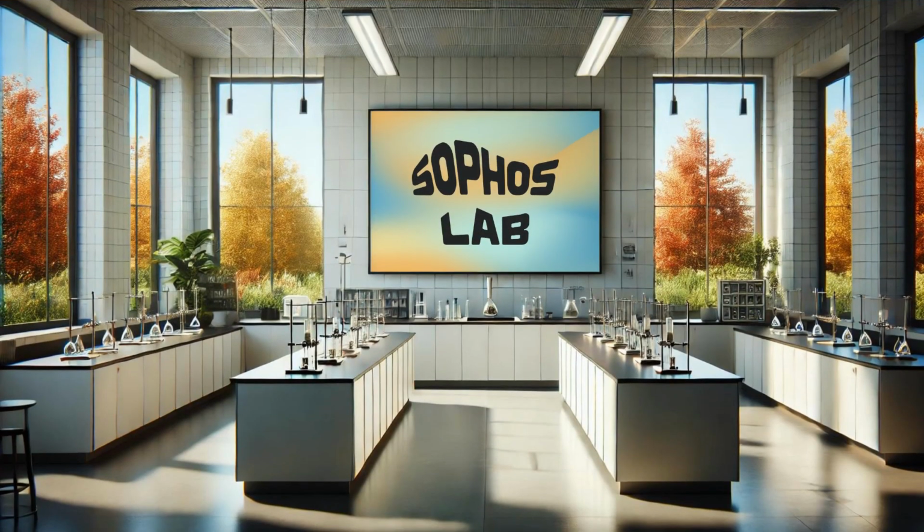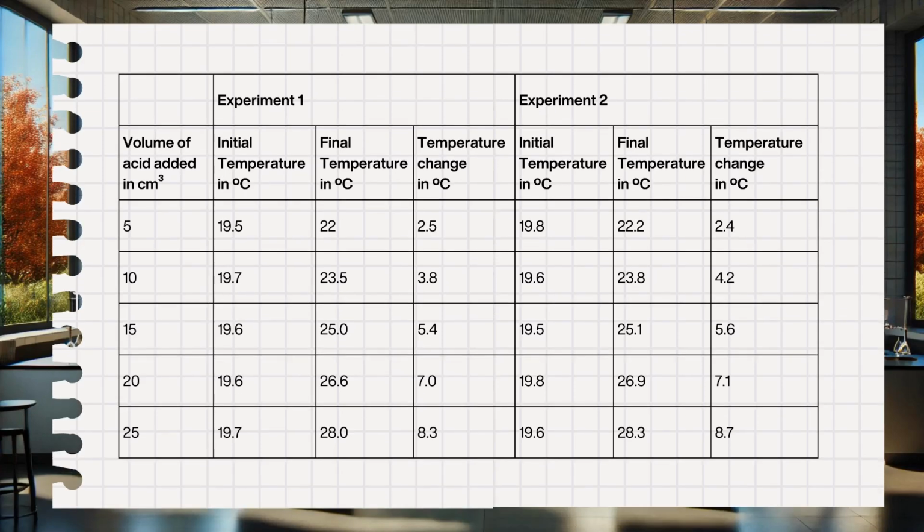Let's now move on to analyzing our results. For each experiment run, subtract the initial temperature from the final temperature to find the temperature change. These calculations are displayed in the two highlighted columns on the table.